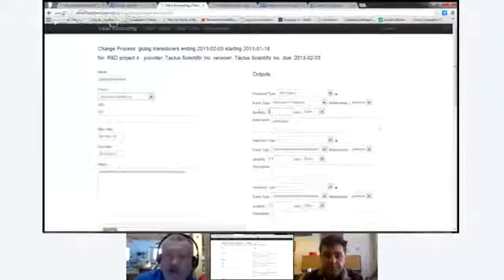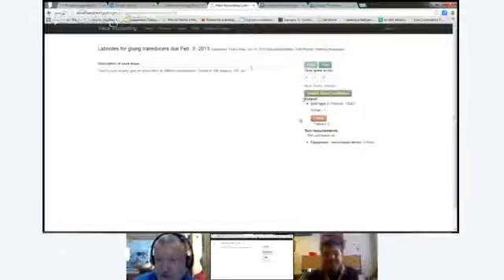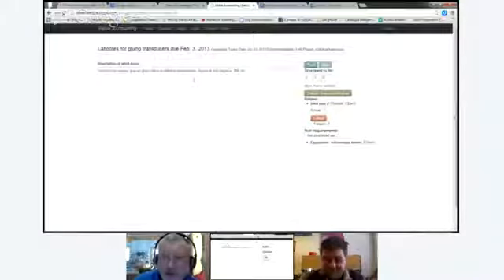That's a good question. And this is an example of why I am sure that this R&D stuff is just a beginning, and it's going to need a lot of changes. Like anything else. These are the kinds of changes. Like, okay, now what kind of outputs do we want? Do we want to require that there is some sort of output? Or do we care? Because I'm going to make it so that the system itself is not going to crash and burn if you don't have an output. Unless you want to require at least one output.